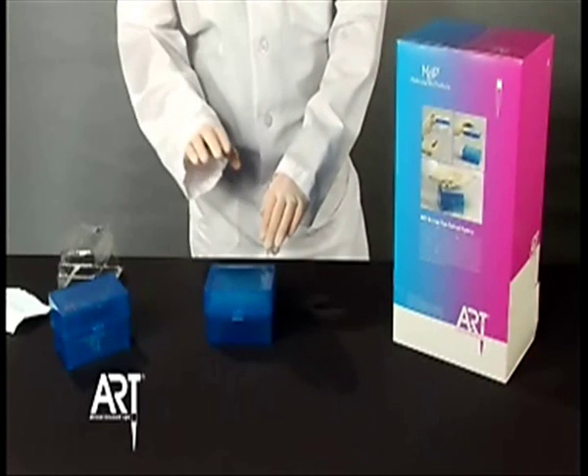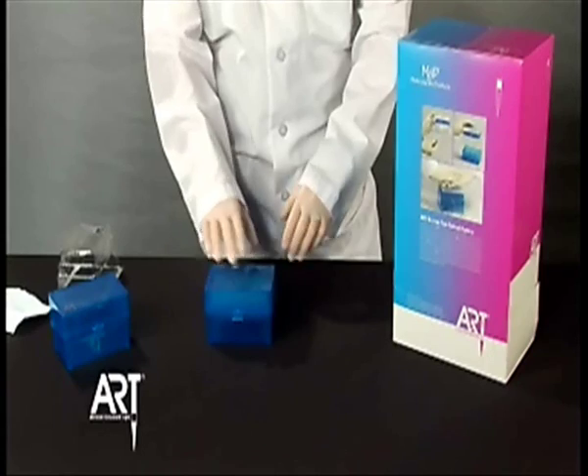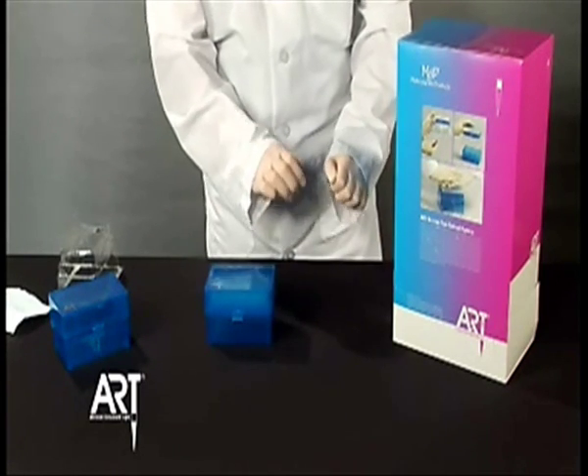The Art Reload system provides space-saving, stackable racks, easy one-handed reloading, and empty racks which make converting to the Reload system easy.